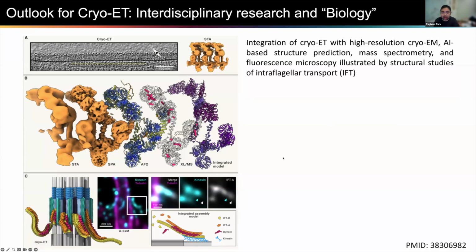Now there are a lot of tools such as AlphaFold, or in cases where there are available crystal structures or EM structures that you can map your lower resolution cryo-ET map into. But having more information such as fluorescent images or live imaging really complements the cryo-ET data, which is simply black and white.